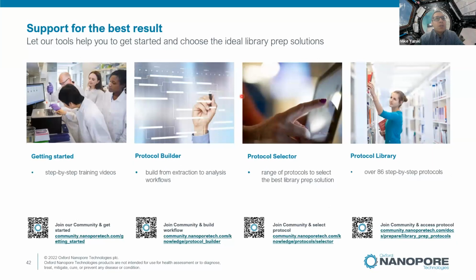So I guess to get started, Nikki and Annabelle have been fantastic resources for you. But if you really want to go back and refresh yourself, you can go to the getting started portion of our community. There's also a protocol builder. There's plenty of tutorials and videos on nanopore sequencing. And then there's a protocol selector to help you expose protocol. And then there's plenty of protocol libraries.